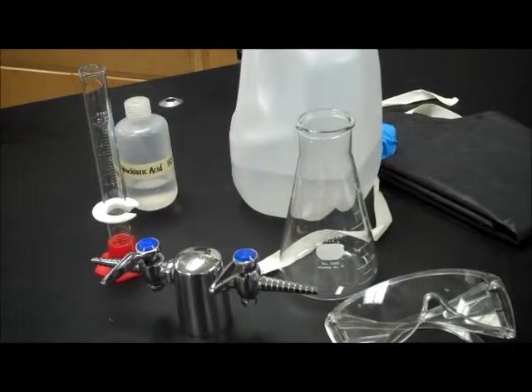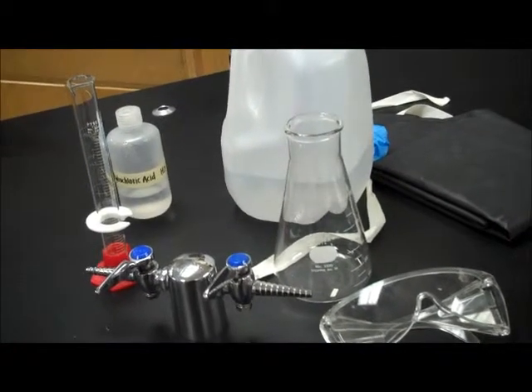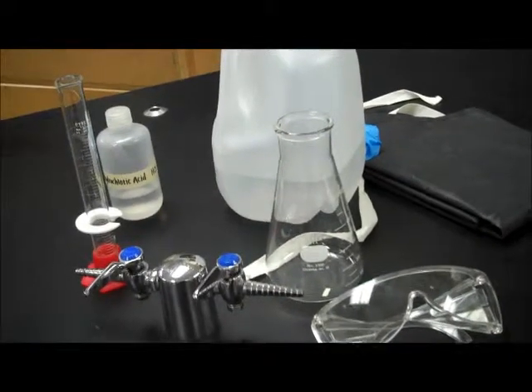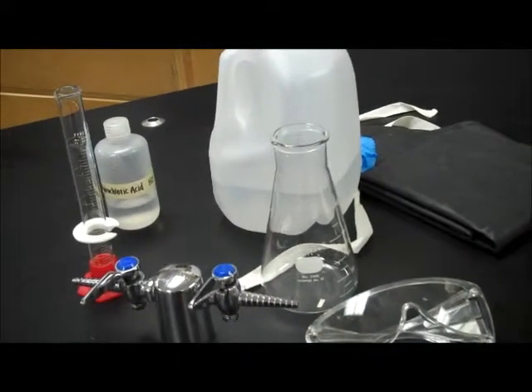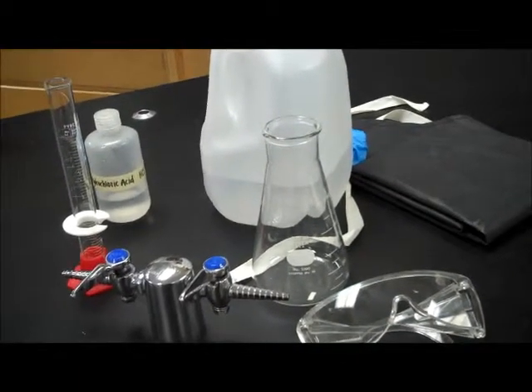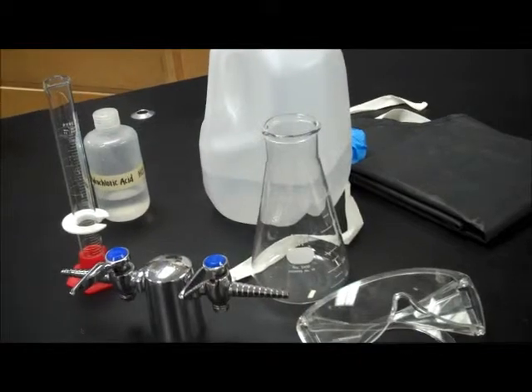The reason you need to add the acid to the water is because when you add water to acid, it'll splatter and splash up into your face. And acid is very harmful if it touches your skin, it can burn you. So you should always add the acid to the water so that it doesn't splatter.